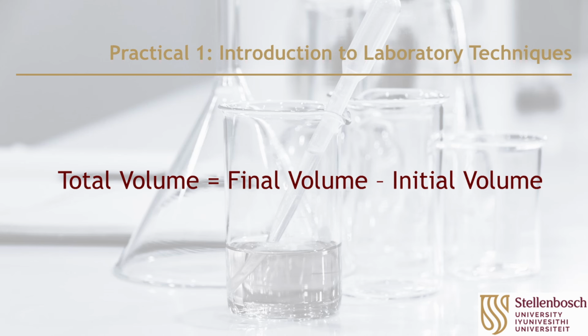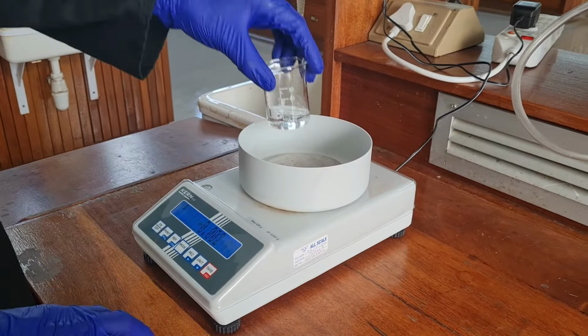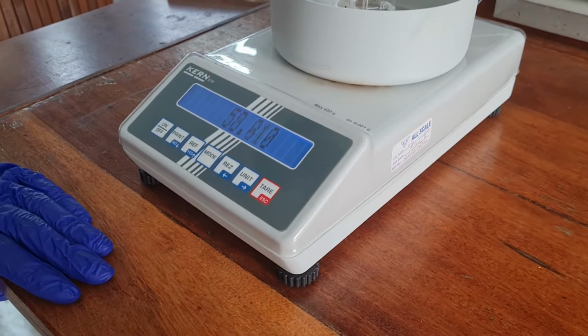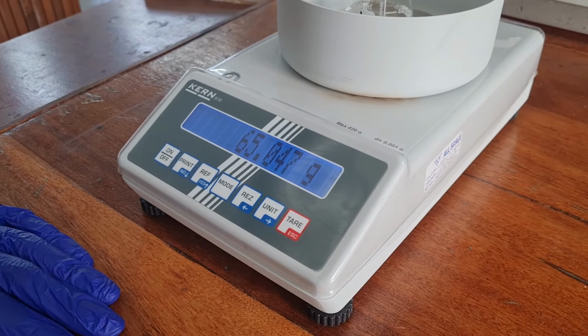Use this formula to calculate your total volume. Weigh the beakers containing the solvent and make a note of the masses as measurement 1, 2 and 3 respectively under the heading using a burette. Pour out the unknown solution into the supplied waste bottle, rinse your beaker with water and dry the beakers using a paper towel.